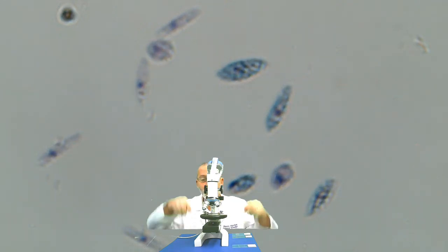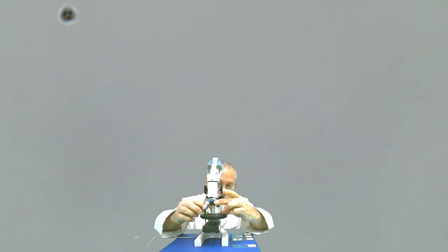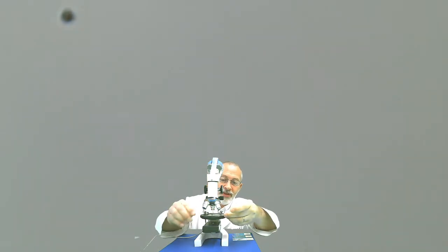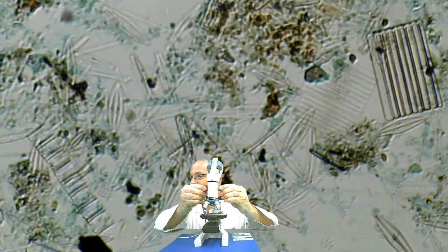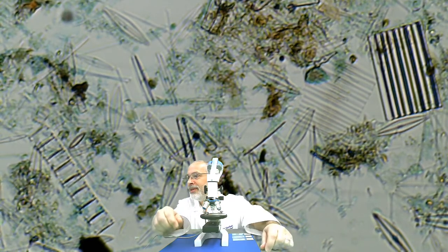All right, and so that is it for the Euglena. I'm going to head back again to the 40 times magnification, and we're going to finish up with my favorite, diatoms. These I just think are really cool looking. Check this out. To me, it looks like somebody had a pile of glass ornaments for a Christmas tree and stepped on them and just shattered them all over the place.